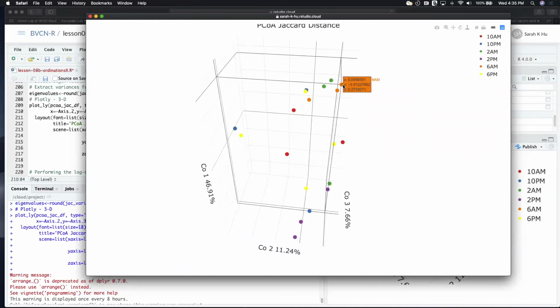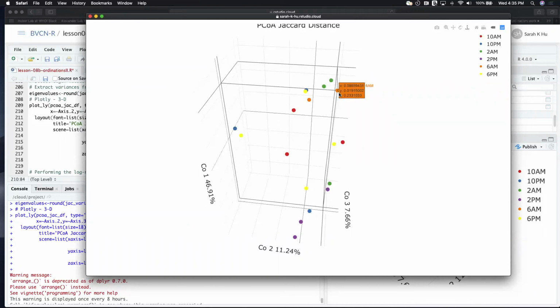So I'm going to end with this 3D plot here, and I'm going to pick up next week by going over some other data transformations and continuing this back and forth of, okay, I'm starting with count data, this is the transformation I did, this is to diagnose what to do next in the PCA, and then work on comparing the stress between 2 different approaches. So with that, I will take any questions, and I will pick up with Ordination's lesson 8C hopefully next week.